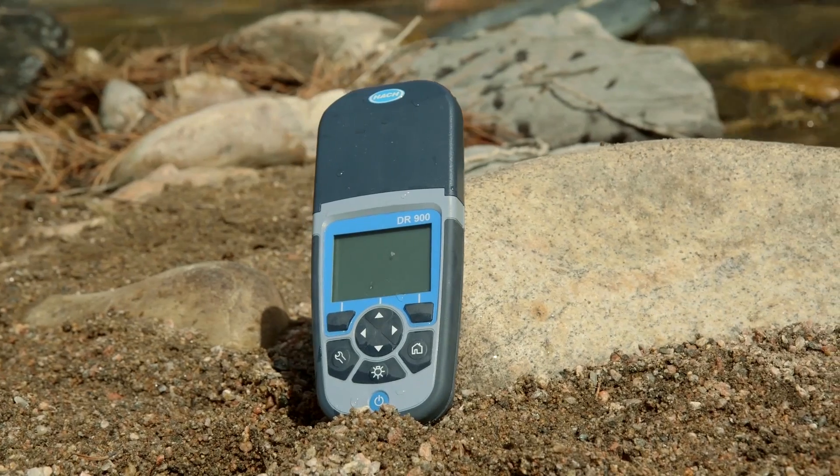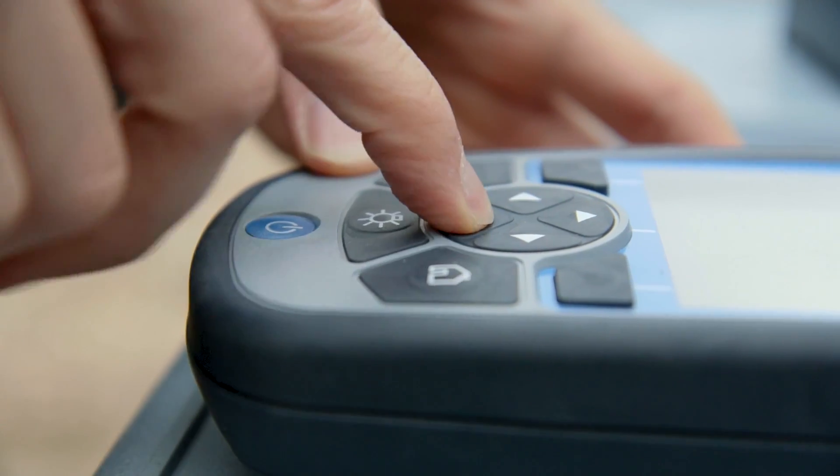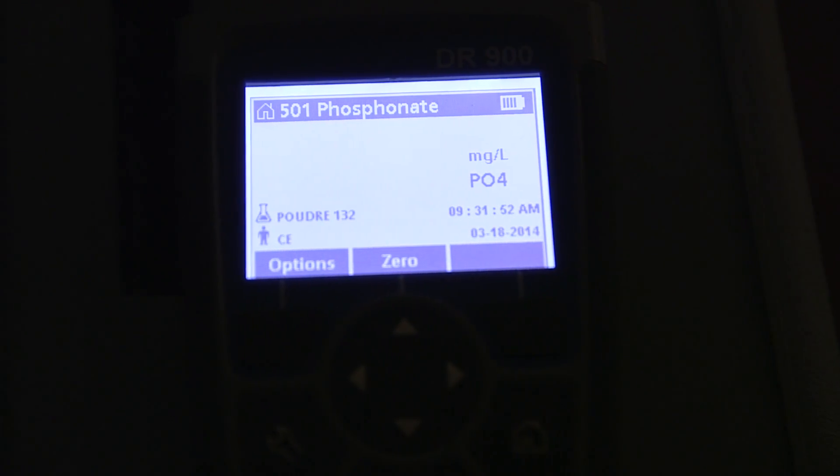With the DR900, you can use one handheld instrument for 90 of the most common parameters. Use the backlit display at the push of a button for use in low light areas.